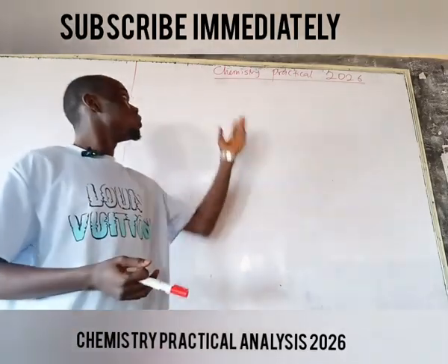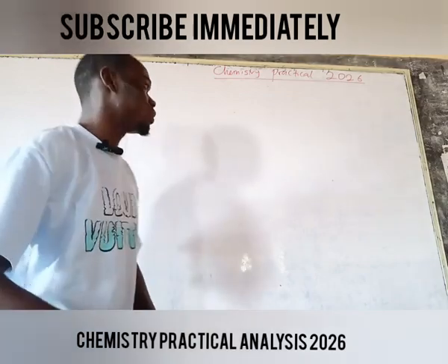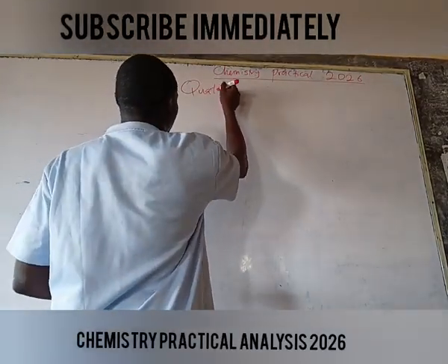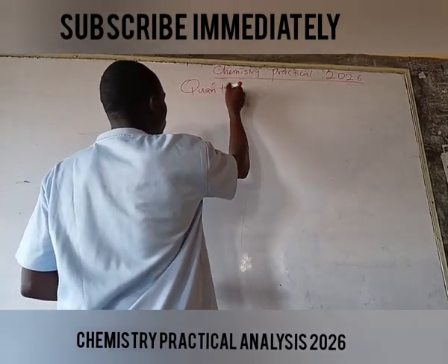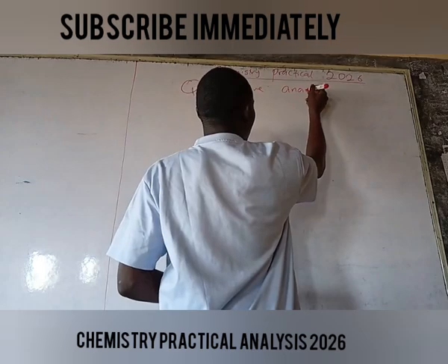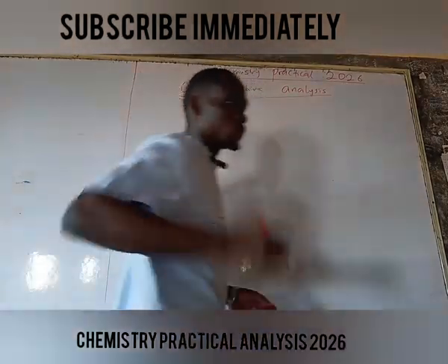Good everyone. Today we are moving to chemistry practical analysis. So let me start with the quantitative analysis, which is titration.